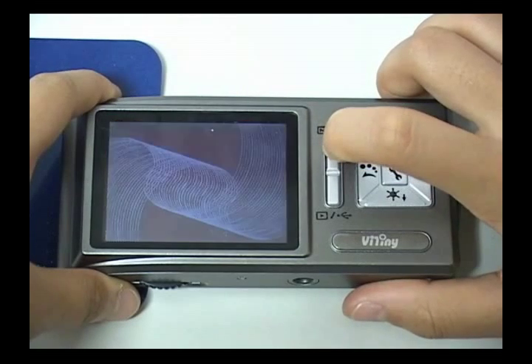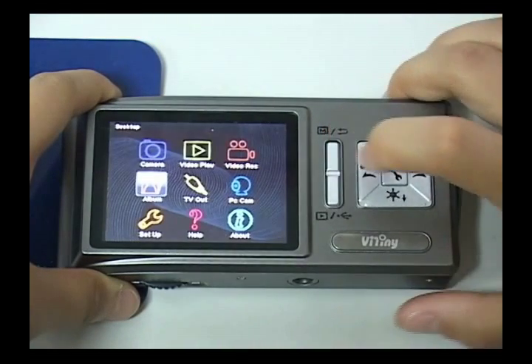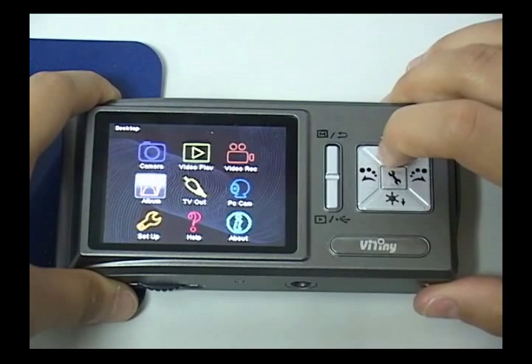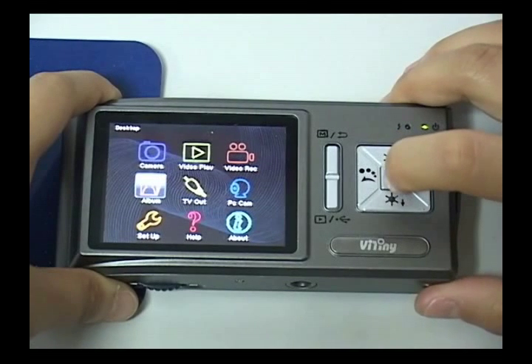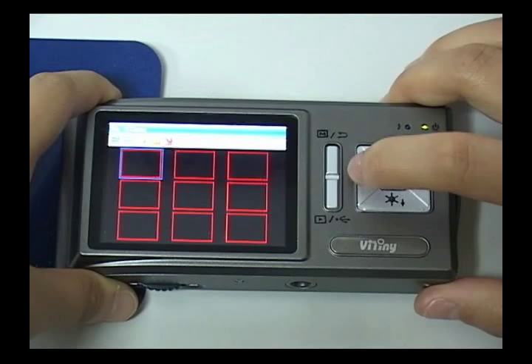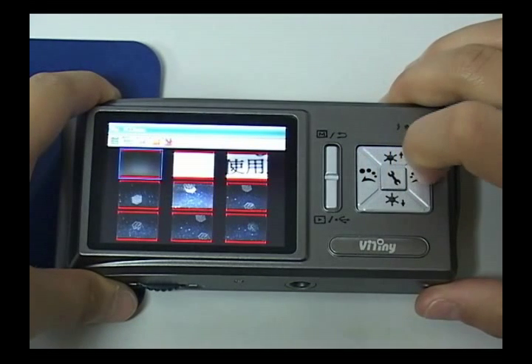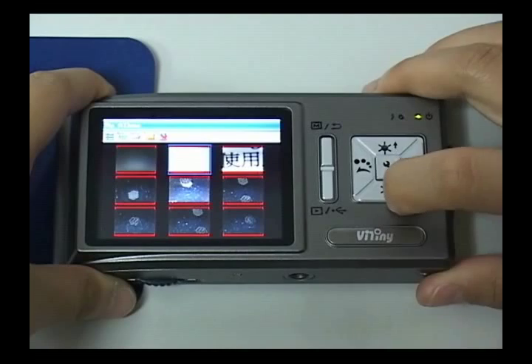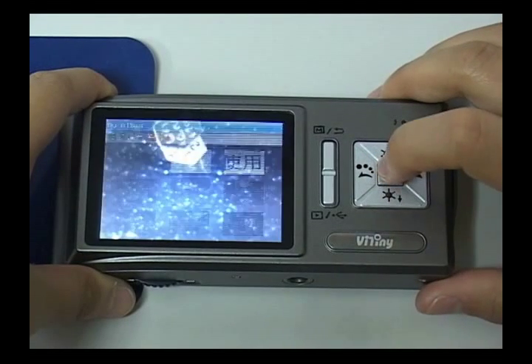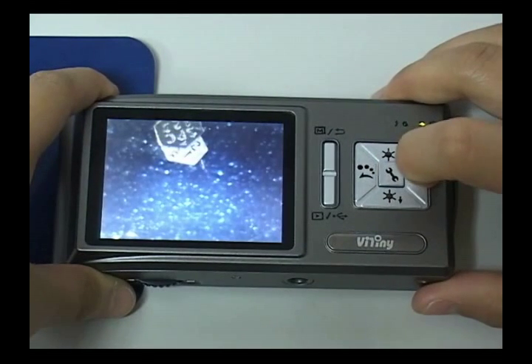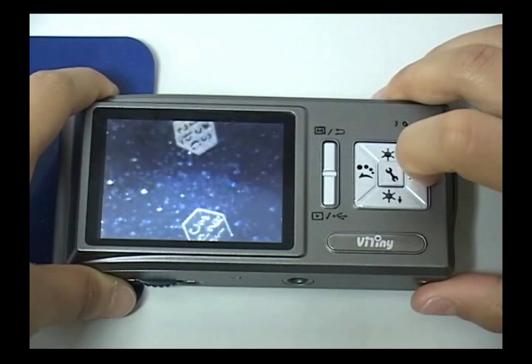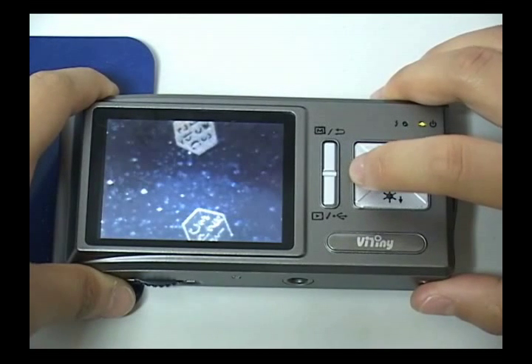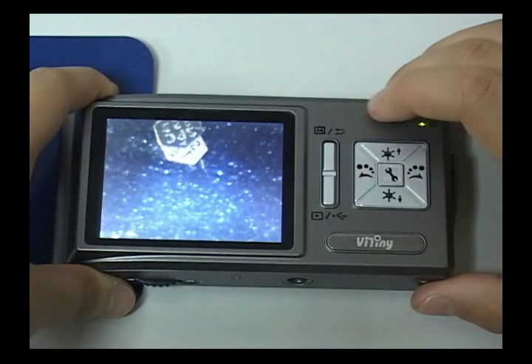Press Preview button to preview captured image and select Album to see all captured images. Click bottom button and middle button to start previewing image. Click bottom right button to see next image and click bottom left key to see previous image.